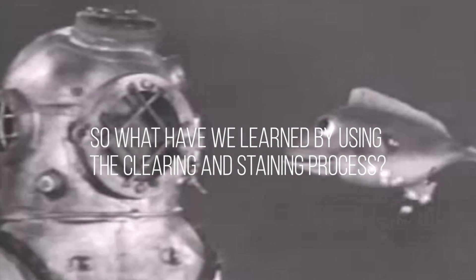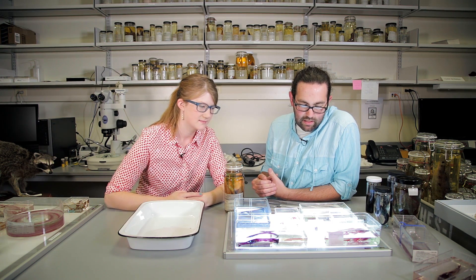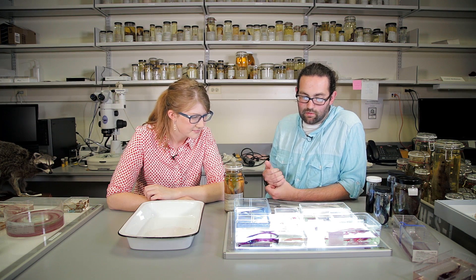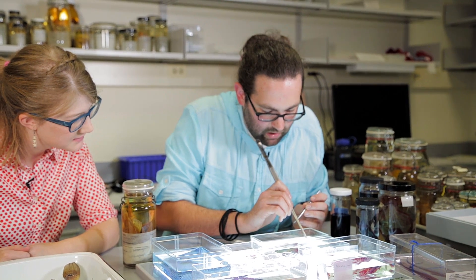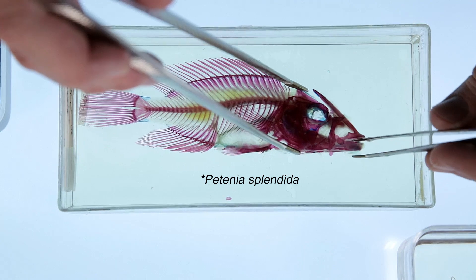What are some discoveries or novel concepts that have come from this process? In my own research I've used cleared and stained specimens to look at teeth and the morphology of jaws — how they look the same or different between species or across groups of fishes. We have this incredible diversity of morphology in fishes. This particular species has a very long structure called an ascending process off of this upper jaw bone — it's like a big extra bone up its forehead.